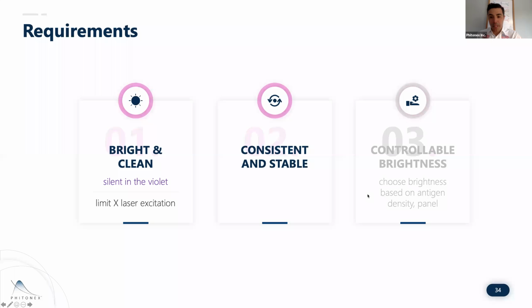So the other part of this was, honestly, a little bit like therapy: what is the stability that we've seen with tandem dyes, right? And how can we go after that? Because when I show people new colors, they're like, hey, that's great. But here in the real world, these things need to work really well. And by the way, one of the biggest pains of any of those other experiments, 40, 45, is that you have to use the BUVs like 2 hours before in creating your master mixes. Holy smoke. Otherwise we could make a master mix that has that, even if it's a high volume, and have it ready. Anyway, I digress.